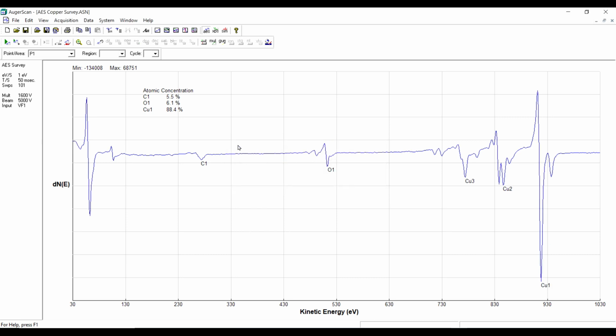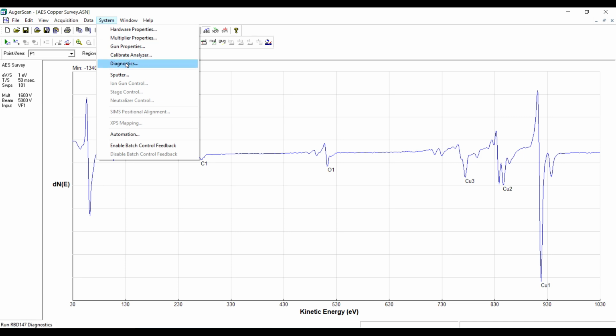Okay, now I'm continuing. This is after I selected that. So System Diagnostics allows us to access parameters that you generally are not going to deal with. But it's a way, for example, we can write out commands based on the PHI calibration procedures and then see if the voltages are correct. Like for the analyzer control, it might say write out 16FF and then get 1000 volts on a supply. We can use the diagnostics to check those calibrations.